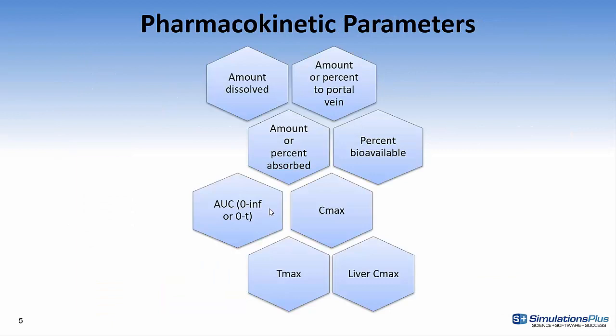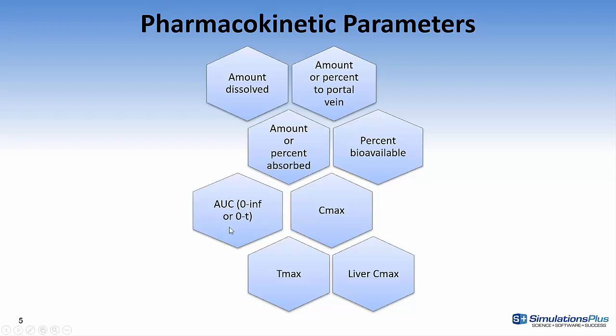These are the pharmacokinetic parameters which you can view in the graph. So you can look at how much the amount dissolved is affected by something such as the solubility. Also the amount or percent to the portal vein, the amount or percent absorbed, percent bioavailability, area under the curve both zero to infinity or zero to time, Cmax, Tmax, and liver Cmax.